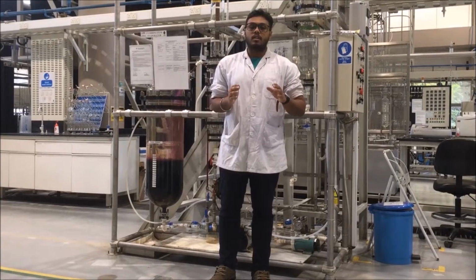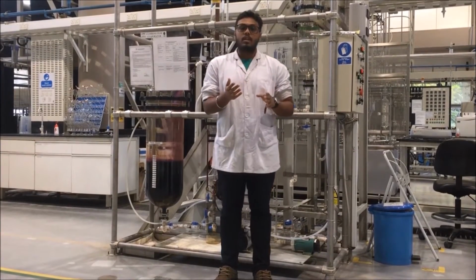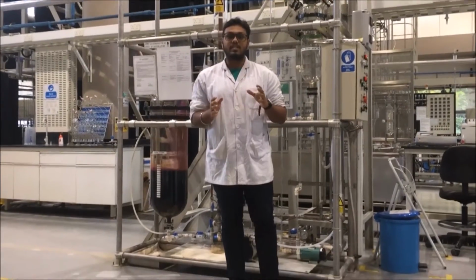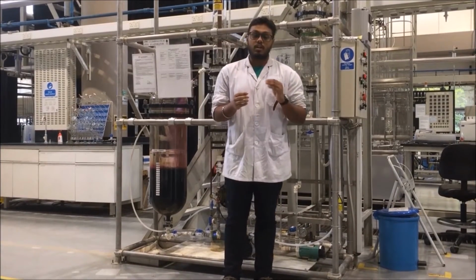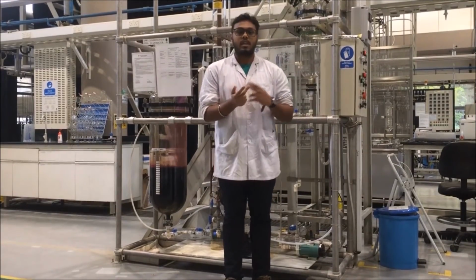The CFE is designed so that it can be operated as a batch or a continuous evaporator. It can be used for the study of concentration of sensitive solutions such as milk, fruit juices and so on.